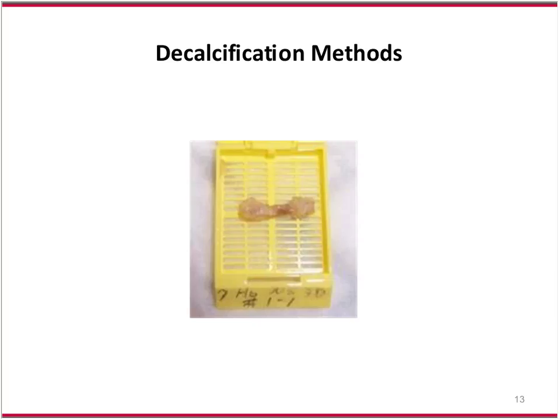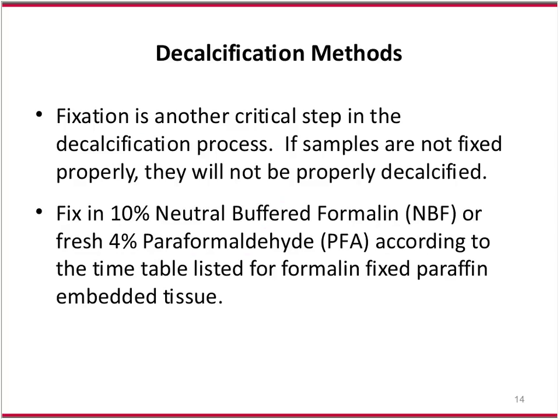Other than that, that's about the biggest femur I'm going to get in my lab, and it makes it very easy for us to decalcify, where I know in many clinical labs you don't have that luxury, but we do.